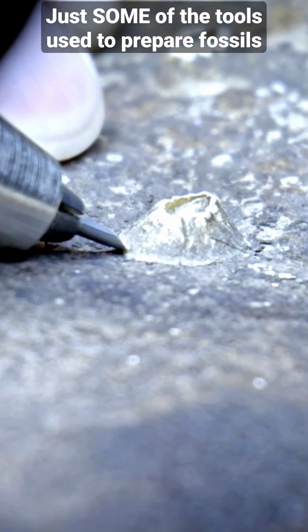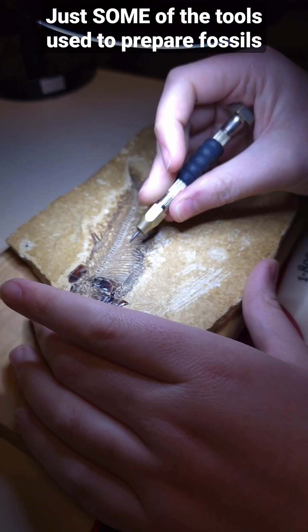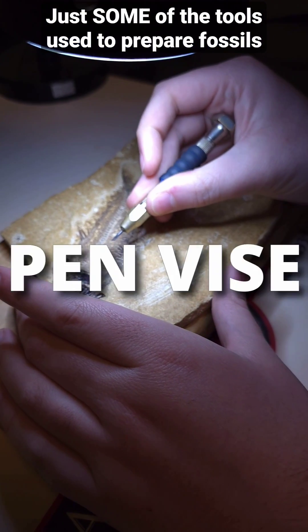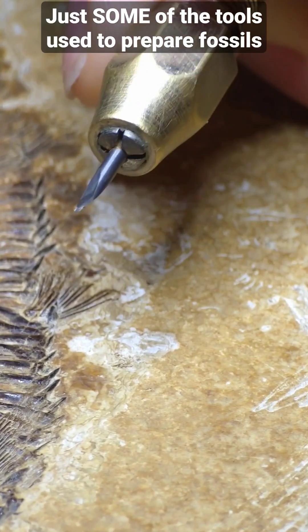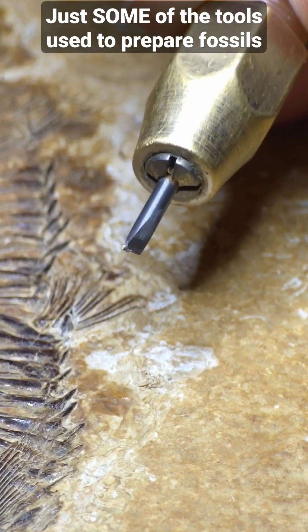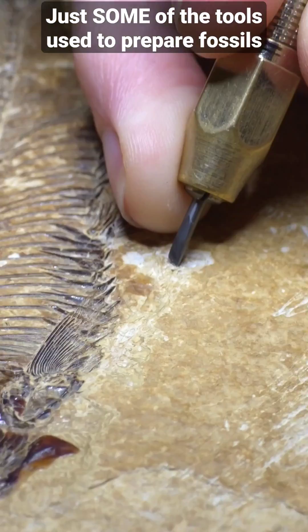This tool here caused some confusion in some earlier videos. A lot of people saw this and thought it was a screwdriver. But what this actually is, is called a pin vise. Other people call it a needle scribe. What you're seeing is actually a tungsten carbide needle, and we use it to do certain kinds of procedures on this Green River material here.